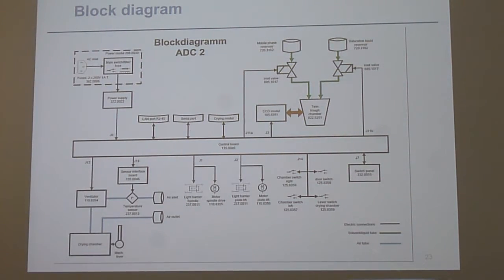The thing is, in 2006, Camag was thinking of getting rid of the serial ports, which we already talked about, and then we learned okay, maybe not that easy, and then now after 10 years we say yeah okay we won't change that, so we took it out. So if you now order a board, you have a hole at the back. Therefore we deliver a small plate you can put on. Then you have the switch panel on top for sure, then you have the twin trough chamber with the 2 valves.